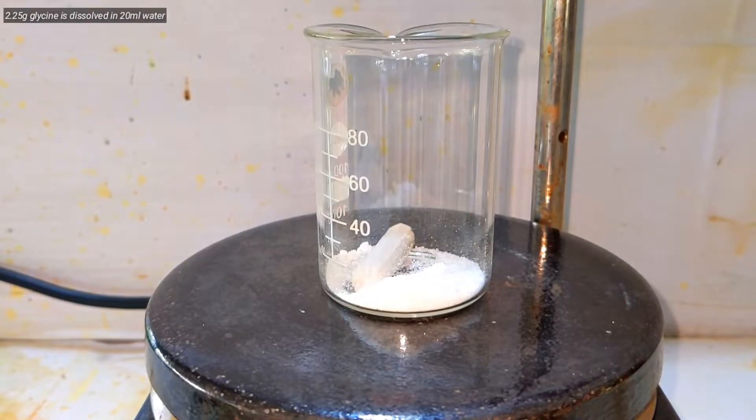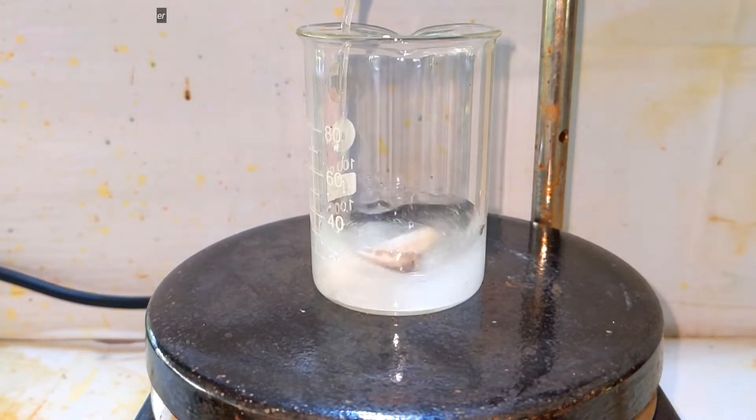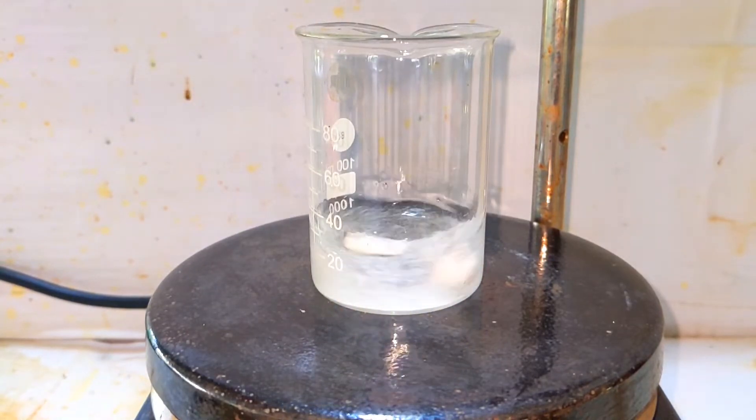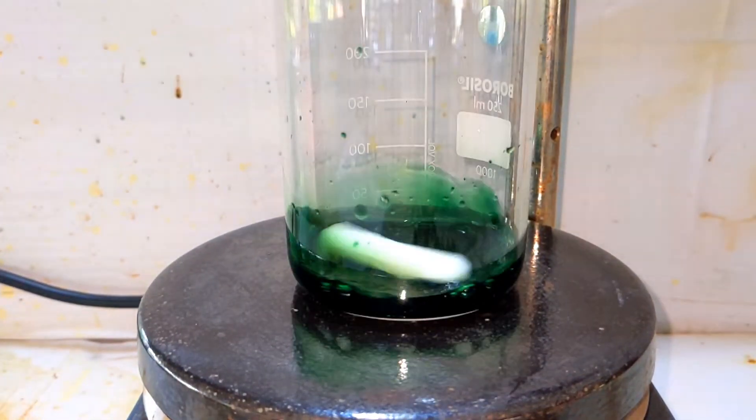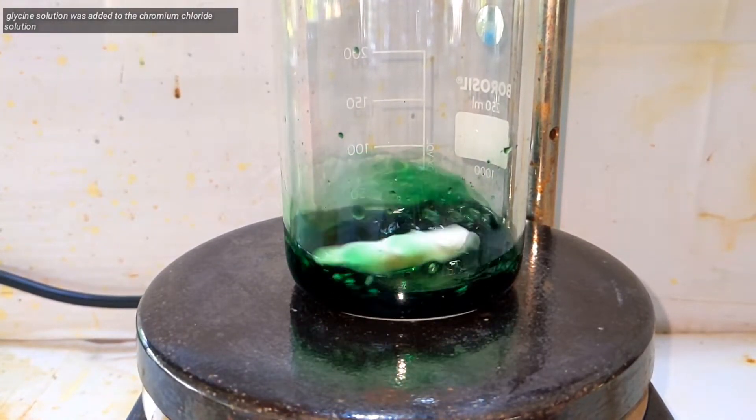Next in a separate beaker, 2.25 grams of glycine was dissolved in 20 milliliters of distilled water. Glycine is an amino acid. The glycine solution was then added to the chromium chloride solution with constant stirring.